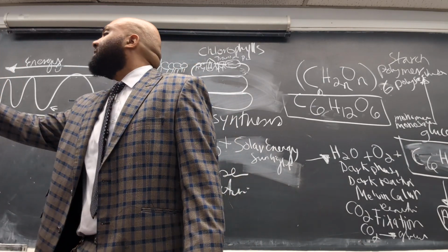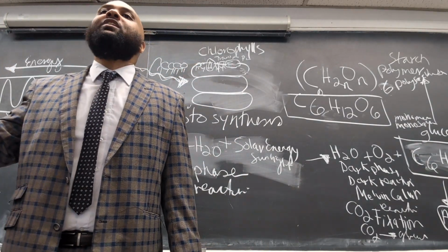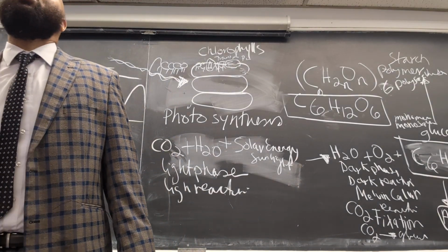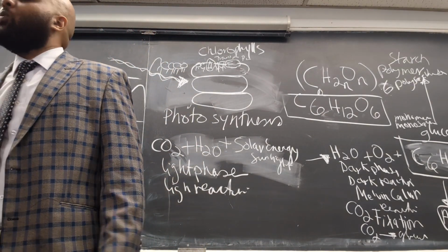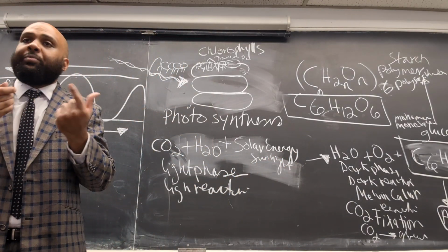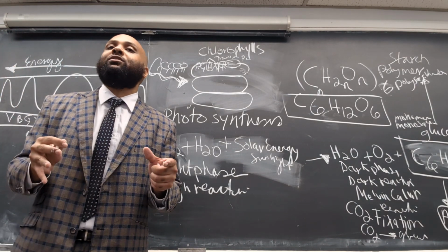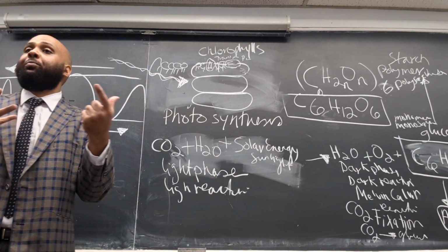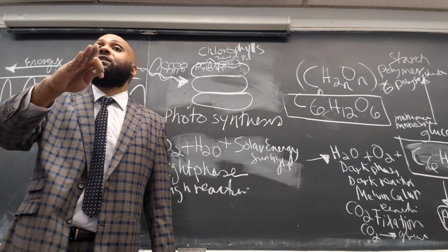If you project sunlight to that extract, that green extract is no longer going to look green. It's going to fluoresce, and it's going to look red. Why is that? Why did it lose its color? Because it absorbed light now. Before it wasn't absorbing, but when you project the light to it, it's going to absorb color, and it's going to reflect a different color.